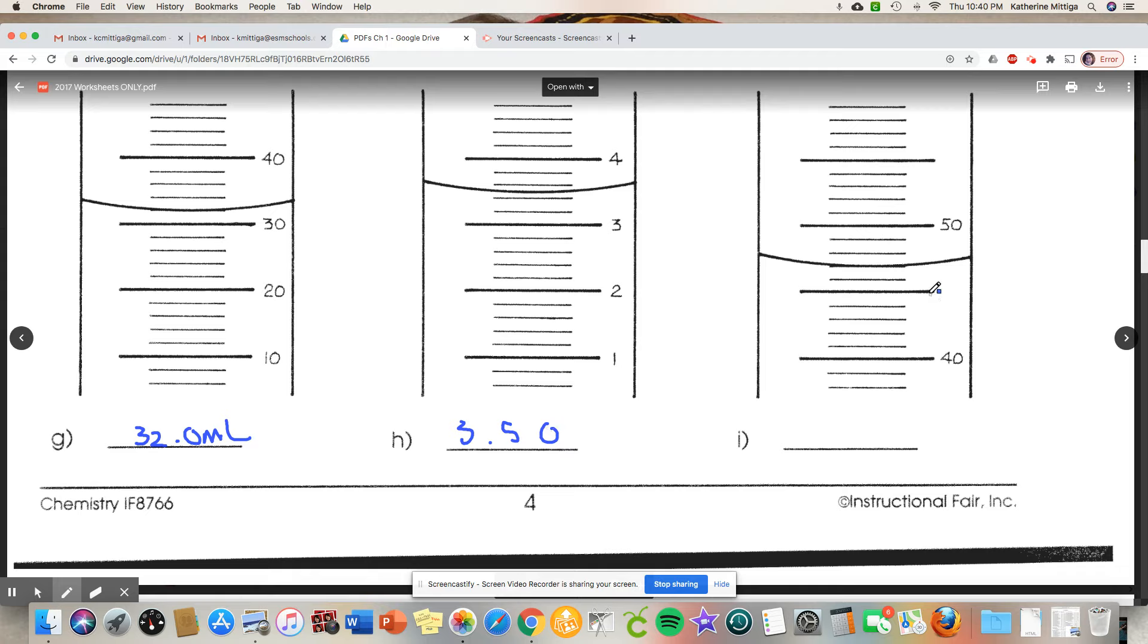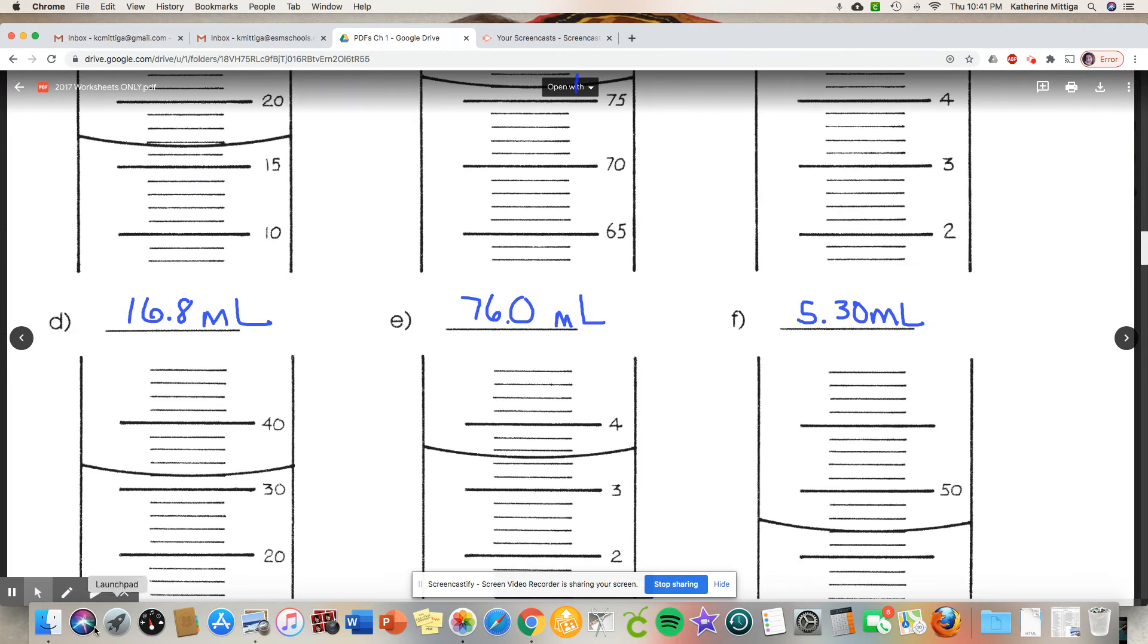And this last one, forty five, forty six, forty seven, but it looks like it's right on there. All right, now that I'm looking back, this one I kind of made a mistake. Oops, sorry. So this one I guess you can get rid of the zero because it's going by point twos and not point ones.